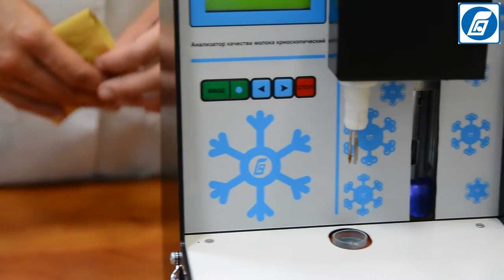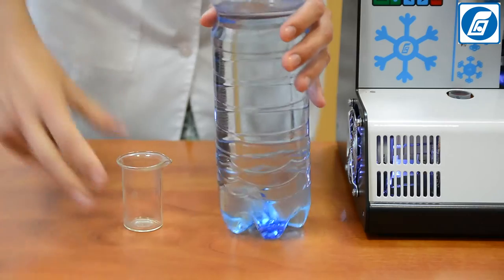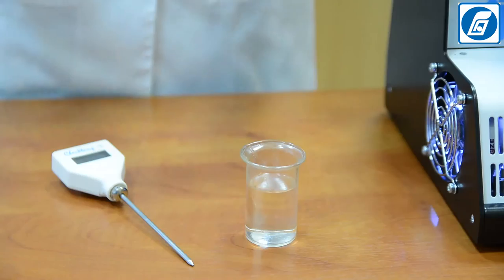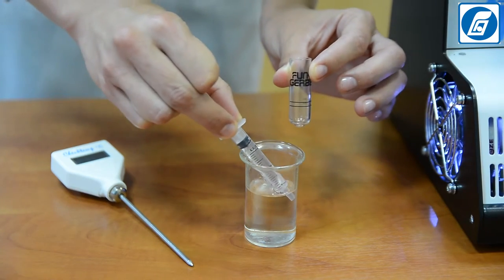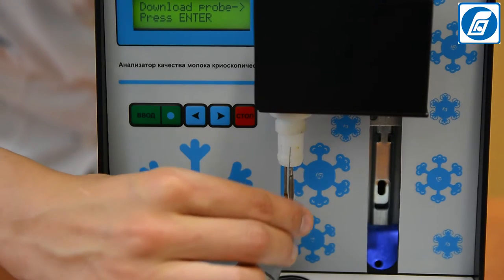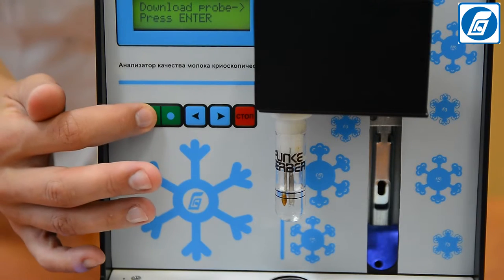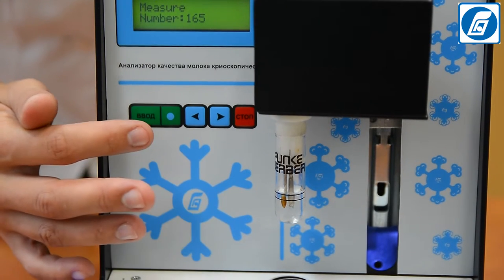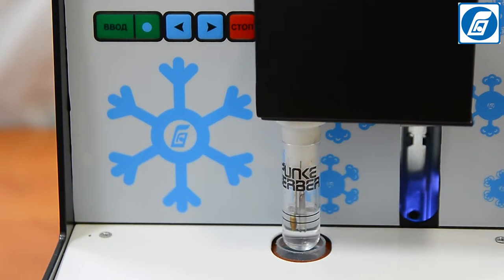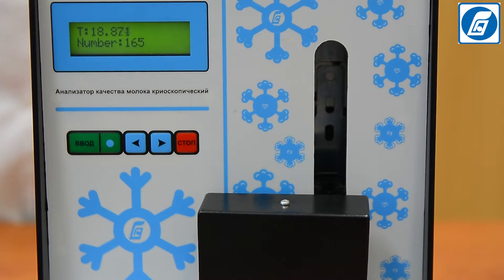Wipe the probe and hushing wire with a soft, clean, non-fibrous tissue. Repeat the operation to obtain 5 measurement results, each time using a freshly washed and dry test tube with the same standard solution. If the absolute error of the freezing point does not exceed ±0.004°C for any 3 of the 5 results at –0.512°C, the analyzer is ready for work. Otherwise, the analyzer must be recalibrated.